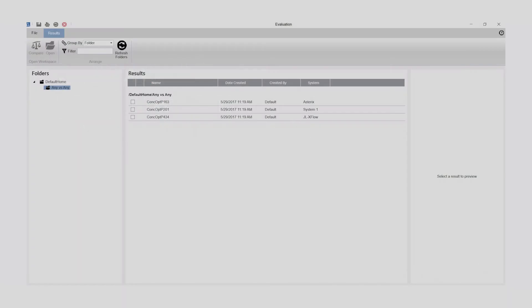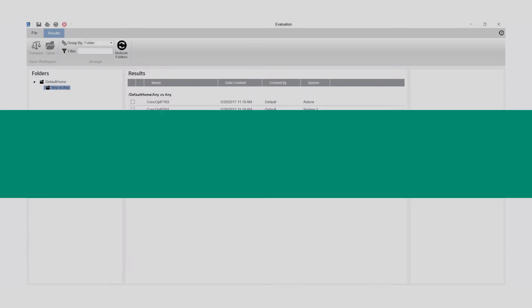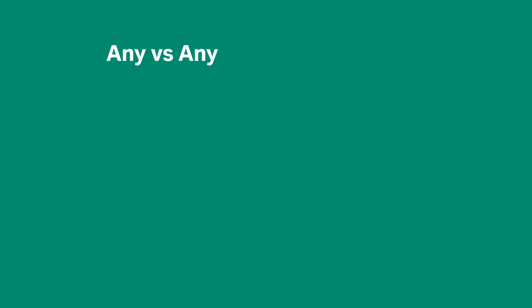The results from any filtration system that runs on Unicorn can be evaluated with Unicorn Evaluation. The Any vs. Any algorithm plots any process parameters captured as curves from a filtration run.